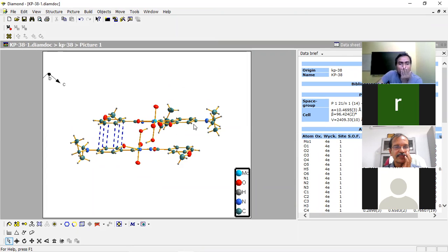If you look at this, this is also the same. You don't need to draw again, or even with the same color you can represent it, because this is also the same interaction. This is CG4, this is CG3 at the same interaction. So we can show it in one, or even with the same color. If you use different colors, then it means that you are having two different pi interactions. But if you use the same color and put CG4 and CG3 underneath, it will be considered as the same interaction you are showing twice. Or no need to show it.